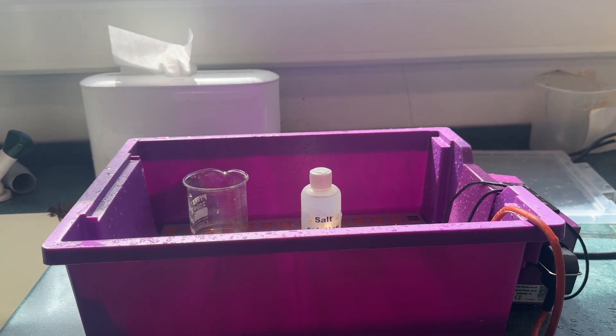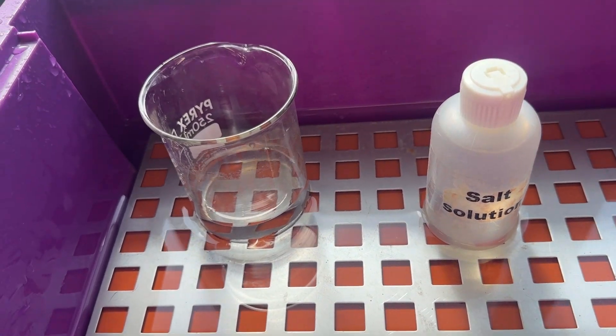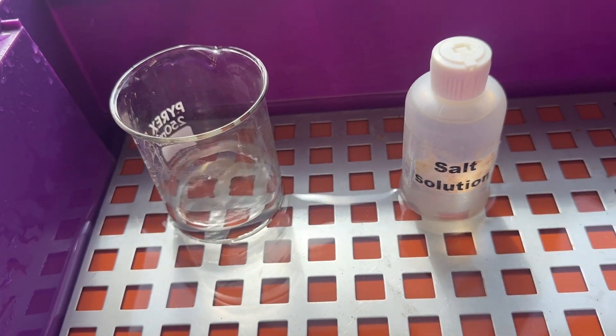Finally we have the water bath. This can be used to heat things which do not need to be heated above 100 degrees. This produces a very regular temperature. We have a heating pad on the bottom and then you have the water.